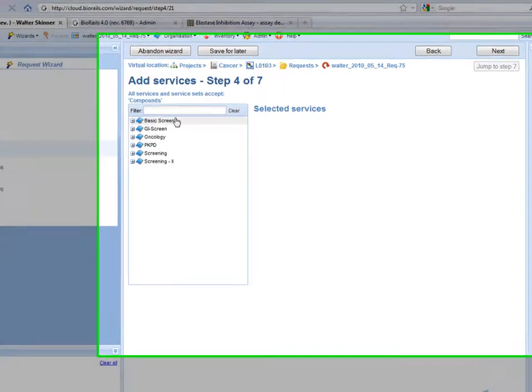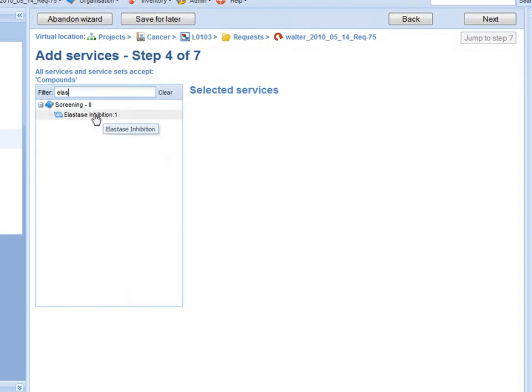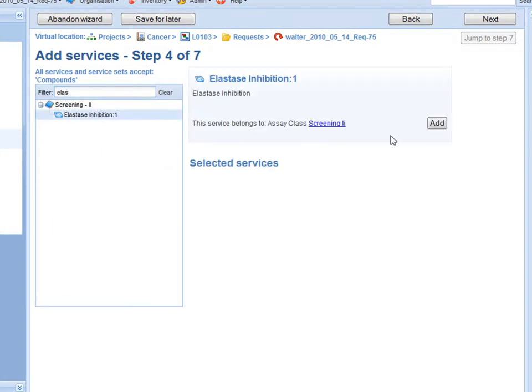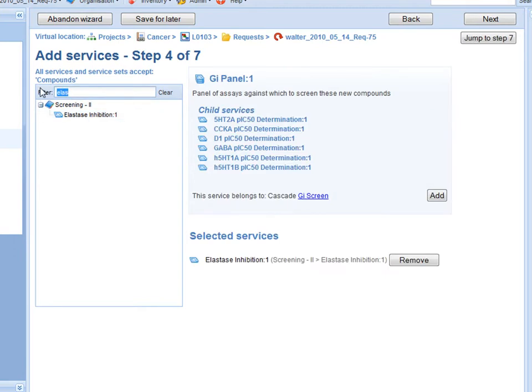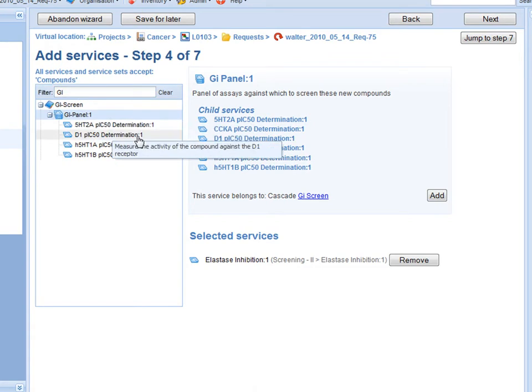Now I'm going to select which services I'm going to run. In this case I want to run the elastase inhibition. I'm also going to run a panel of assays.